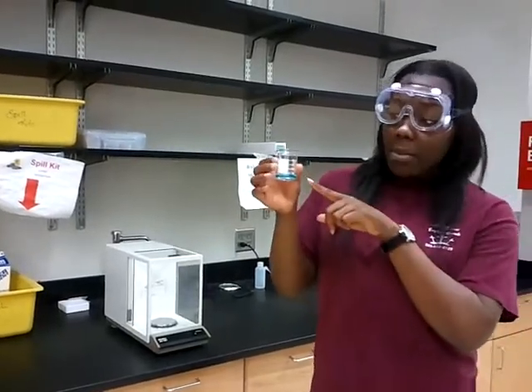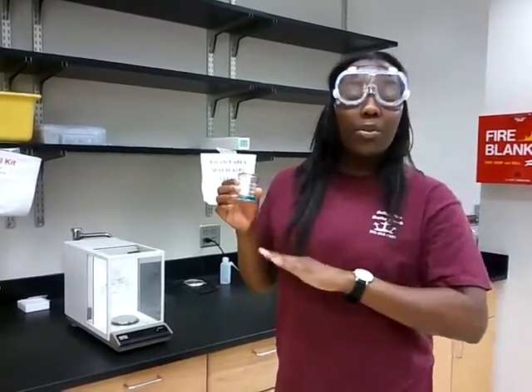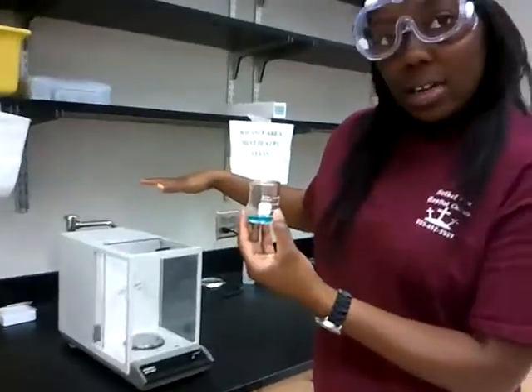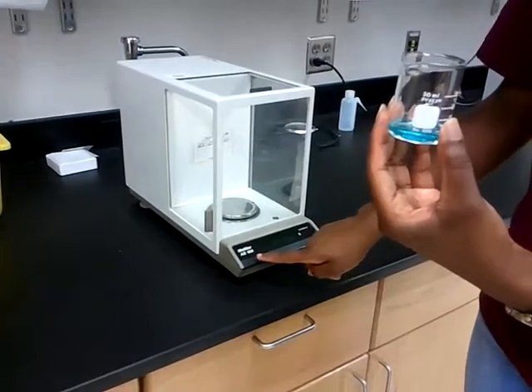Okay, so now we're going to actually measure the weight of our beaker with our liquid in it. Remember earlier we got the value of 31.12 as our initial mass, which is our beaker with no liquid in it. Now we've measured from the pipette, and we're going to bring that over to the analytical balance, turning it on, making sure the door is closed, and zeroing it out.